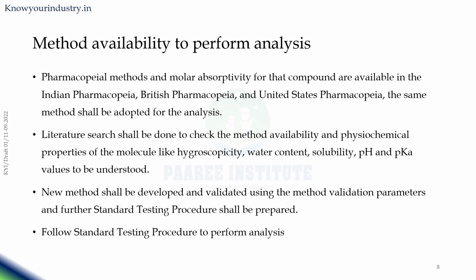So you can find generally these methods in the pharmacopoeias. The pharmacopoeial methods and the molar absorptivity for that compound are available in the various pharmacopoeias like Indian Pharmacopoeia, British Pharmacopoeia, and US Pharmacopoeia. And you can directly adopt the method obtained from the pharmacopoeias for the analysis.